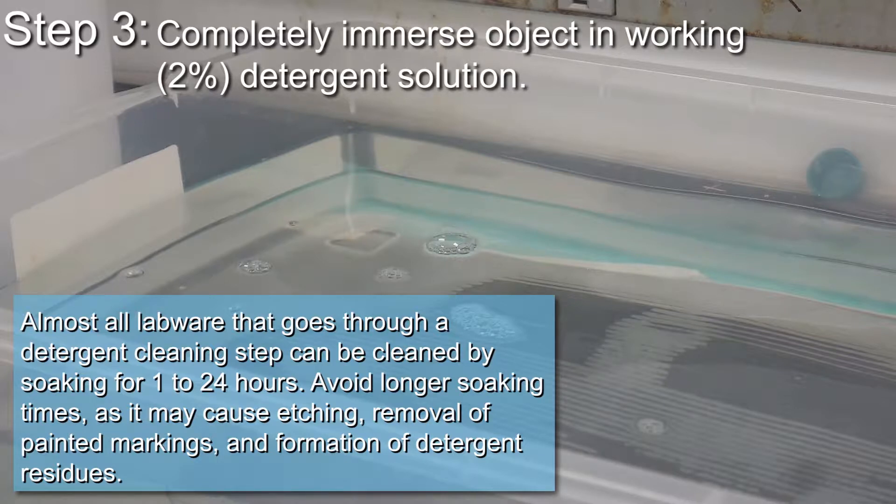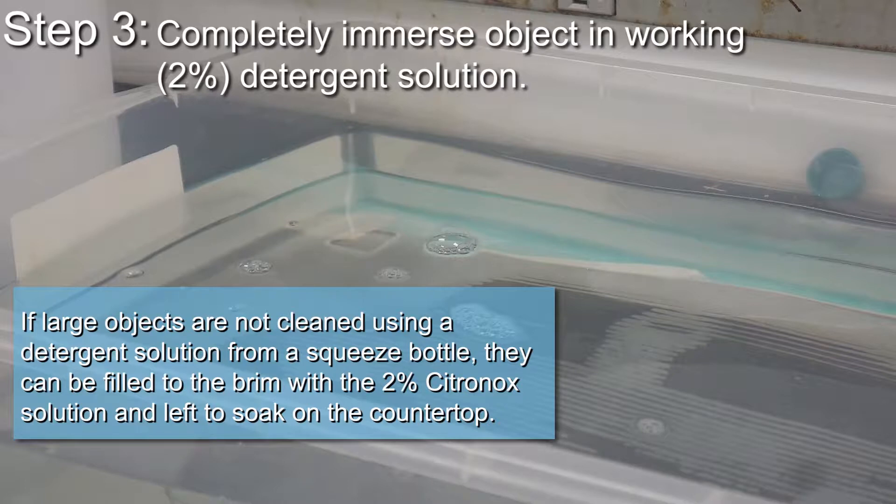Avoid longer soaking times as it may cause etching, removal of painted markings, and formation of detergent residues. If large objects are not cleaned using a detergent solution from a squeeze bottle, they can be filled to the brim with the 2% citronox solution and left to soak on the countertop.